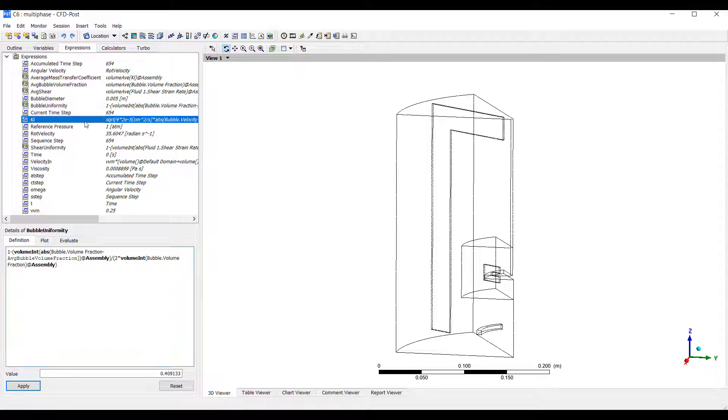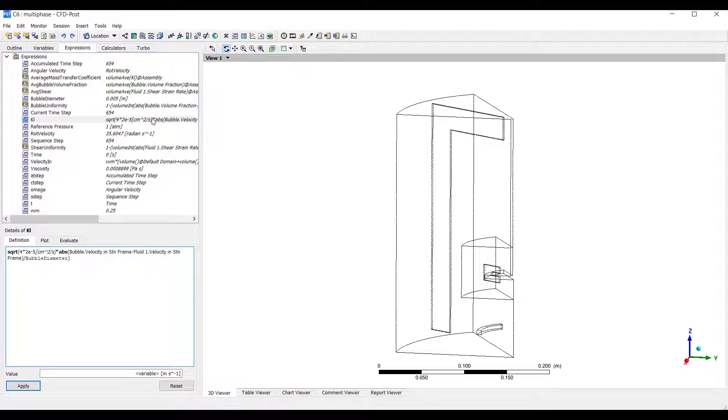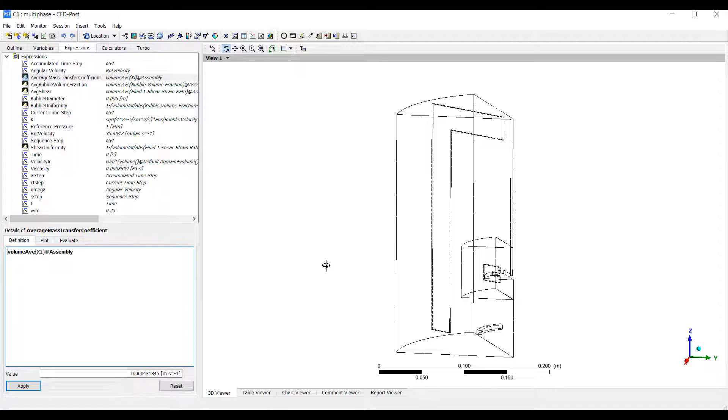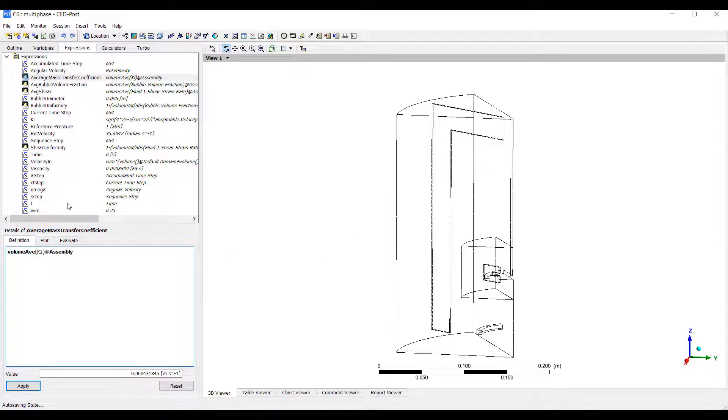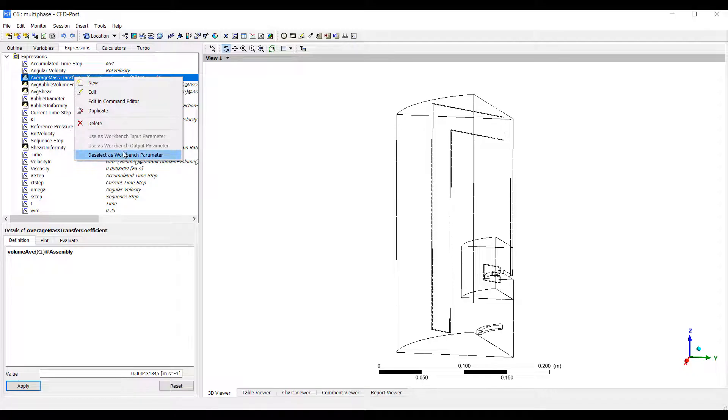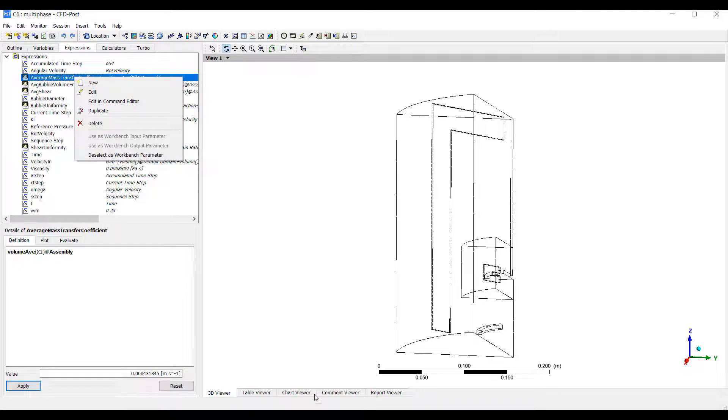I also specified a mass transfer coefficient. We can calculate an average for the mass transfer coefficient here. Using this type of calculations, we can feed this back into a source term or a sink term to specify the mass transfer from the air into the water. Using expressions, we can do lots of really exciting post-processing and get quantitative information. Right-clicking on each of these parameters of interest allows us to specify these as workbench output parameters.